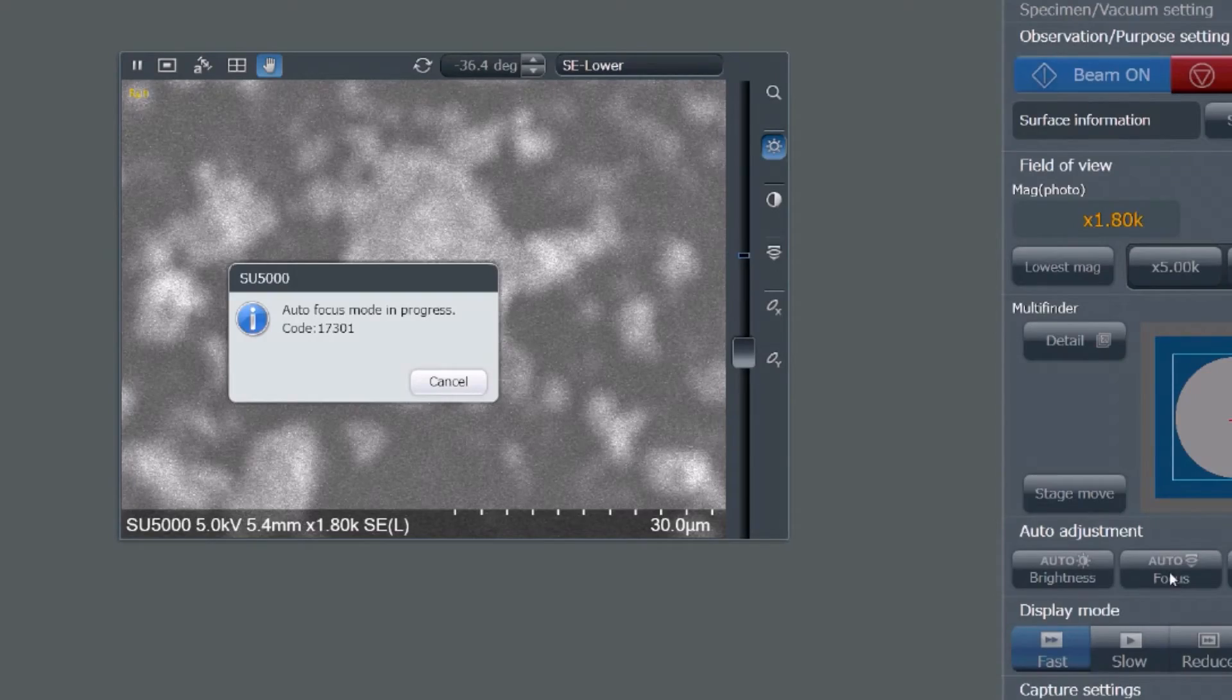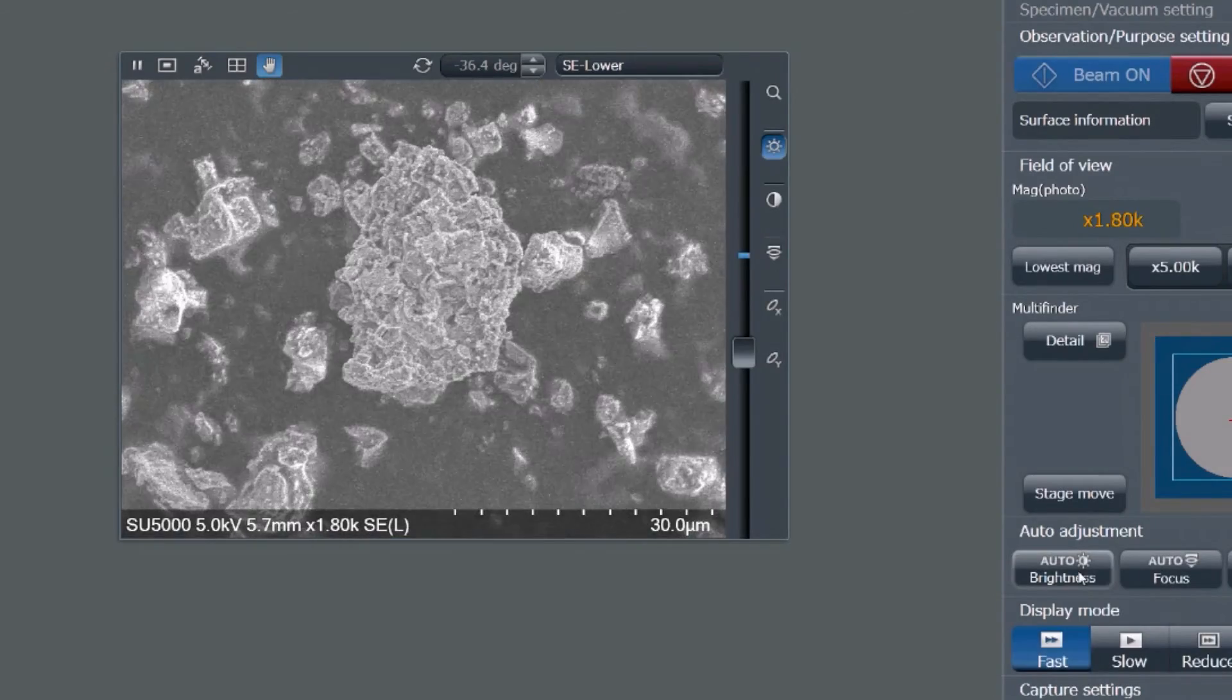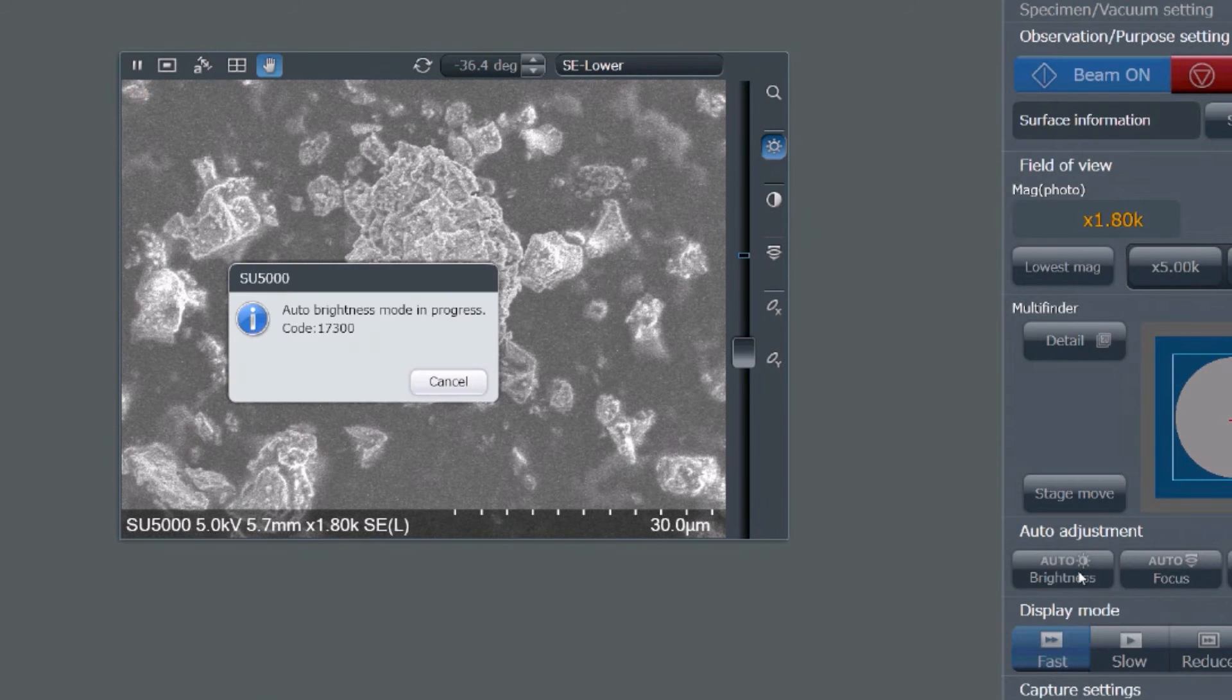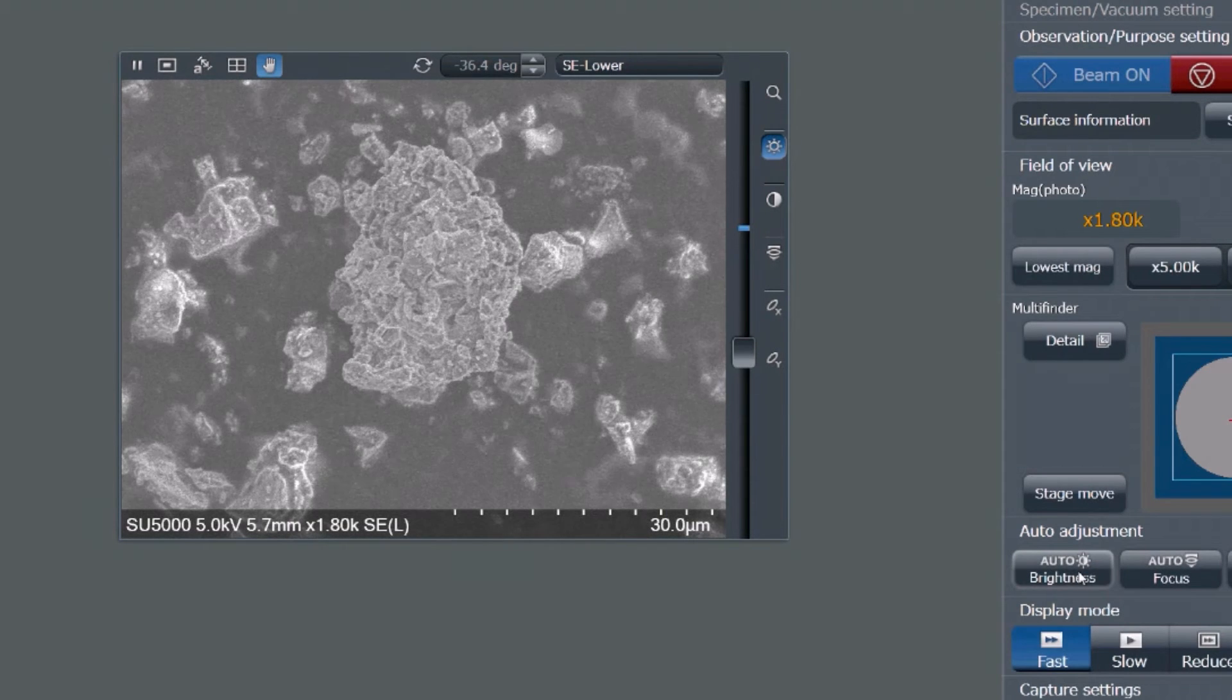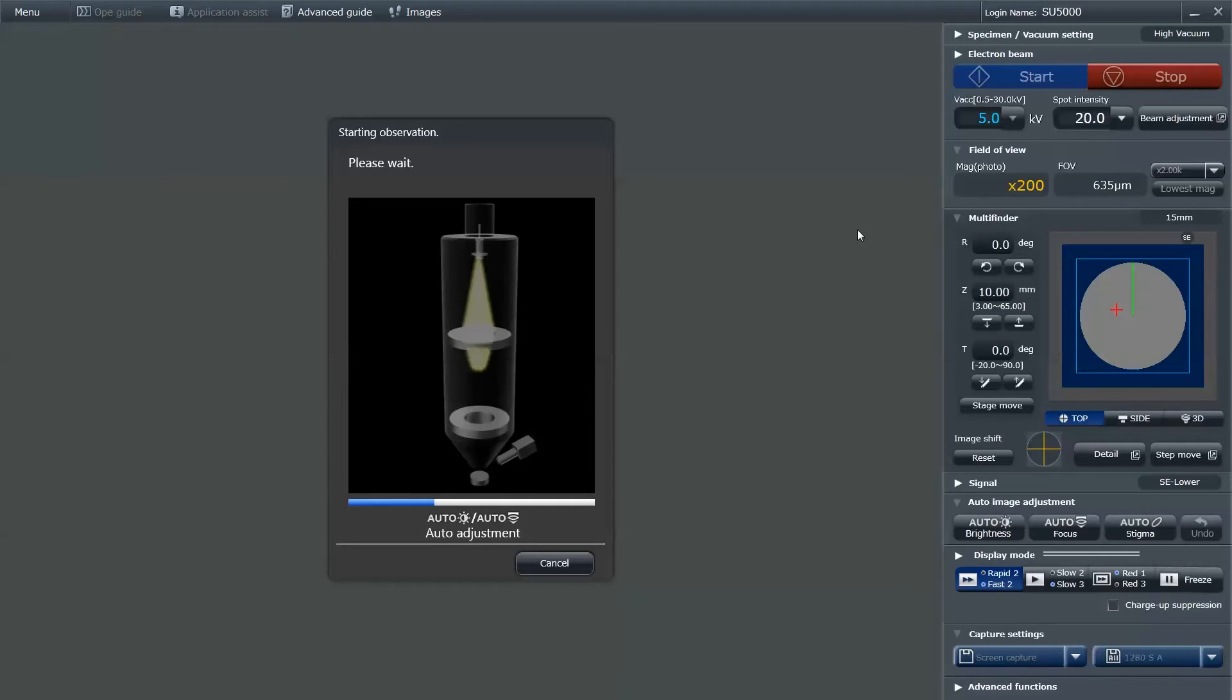The latest incorporation of the innovative and accurate 5-axis stage and navigation software is available now in the SU-5000. The eucentric constant focus tilt feature and auto-calibration and alignment features serve to improve productivity and ease of use.